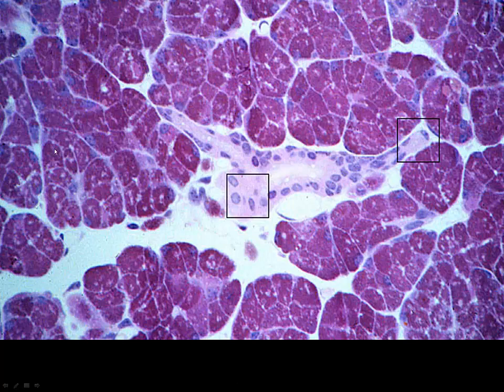And here we can see those acini. We've got our ductal system. And here we actually have an intercalated duct. You see how it narrows? It's almost getting squamous in nature. At this point, this is also getting more and more narrow. Here we have our cuboidal shaped cells.